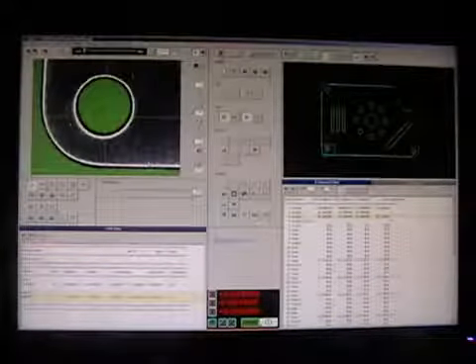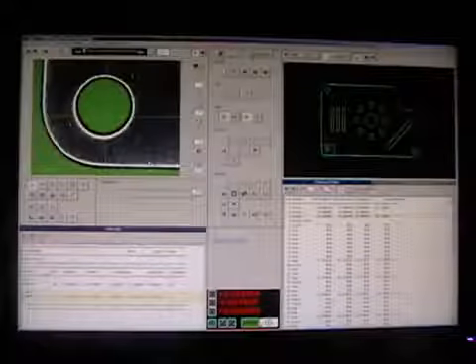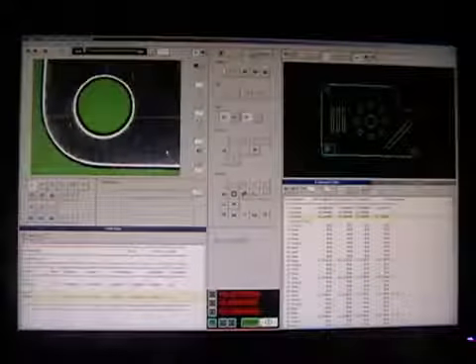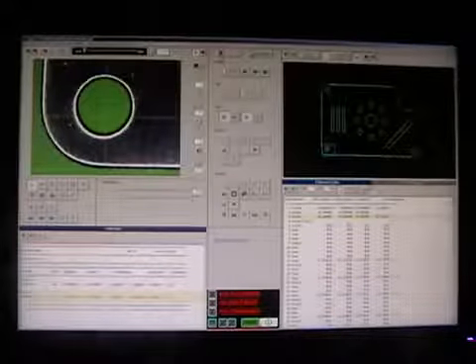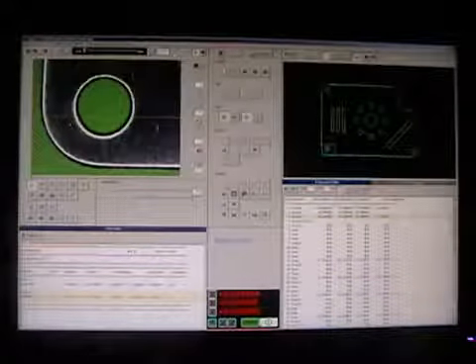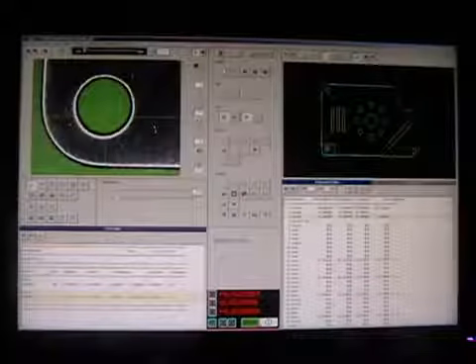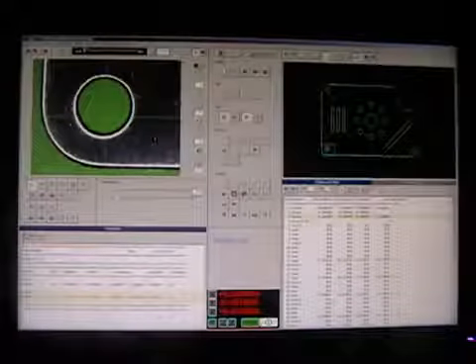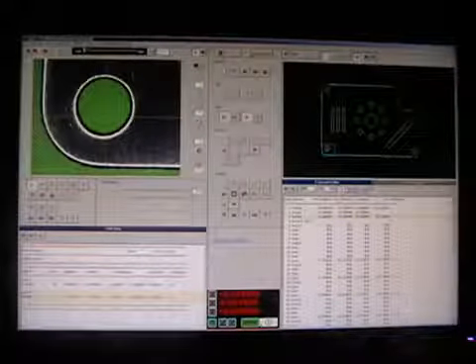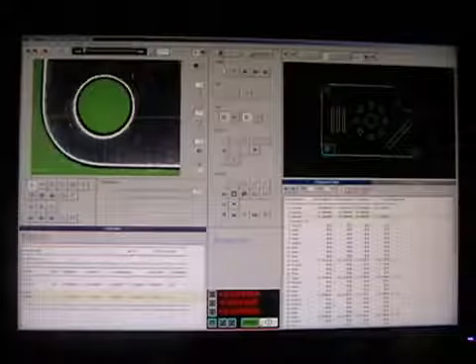First let's go over this basic screen layout. Here in the upper left corner we have the live video image and to the right of that we have some lighting controls.